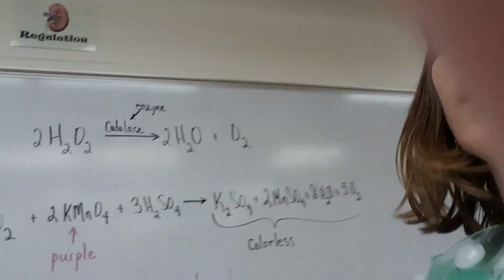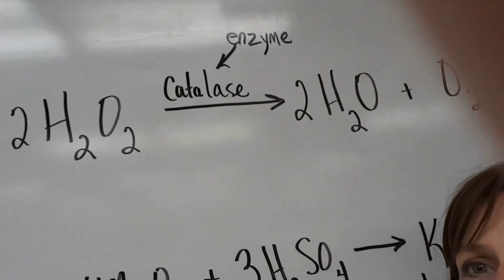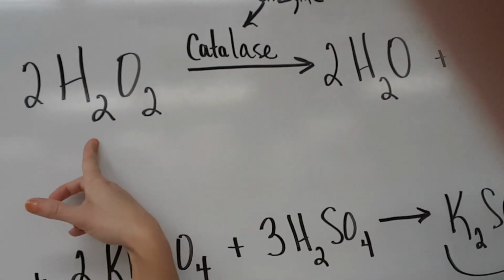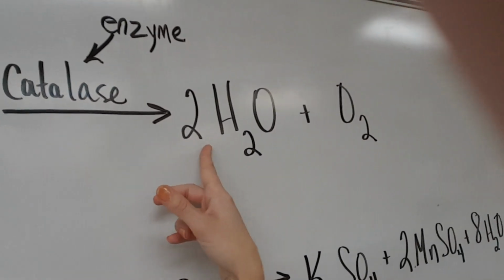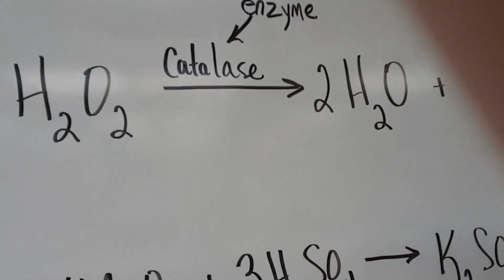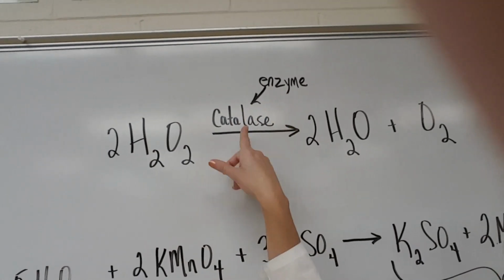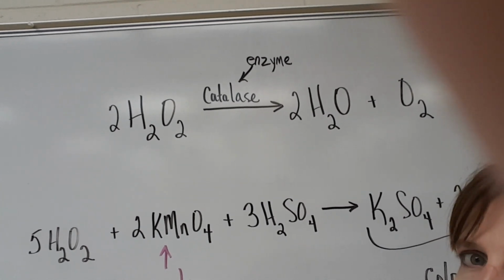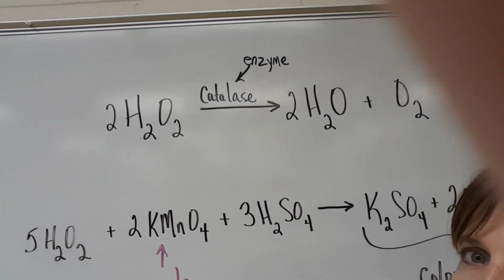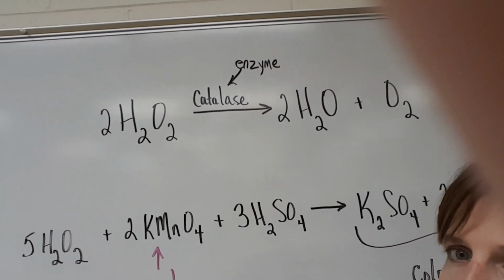All right, so going over to the board here. The reaction that we're going to be working on the decomposition of is hydrogen peroxide, and hydrogen peroxide is going to be able to be decomposed into water and oxygen. It happens spontaneously on its own, very slowly, but with the help of the enzyme catalase, that reaction occurs real quickly. So that is the overall reaction that we are going to be working on testing how fast it happens in various different environmental conditions with the presence of catalase.